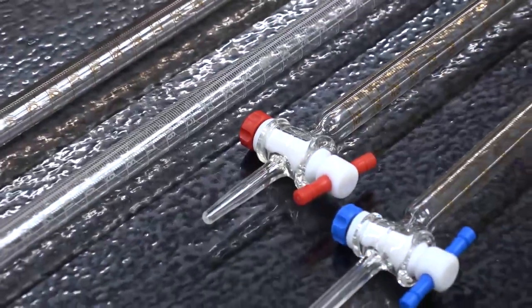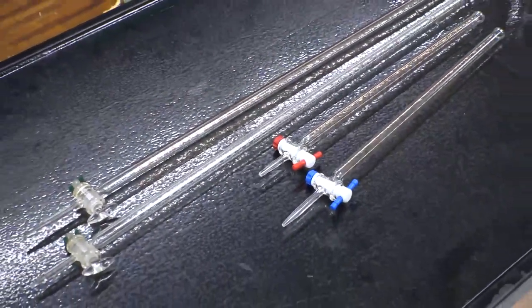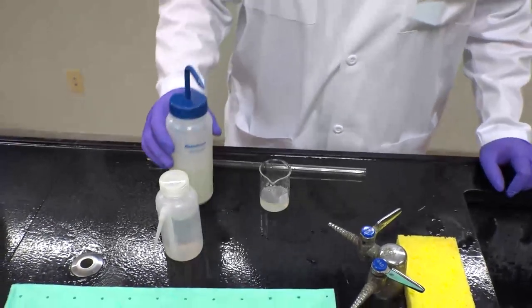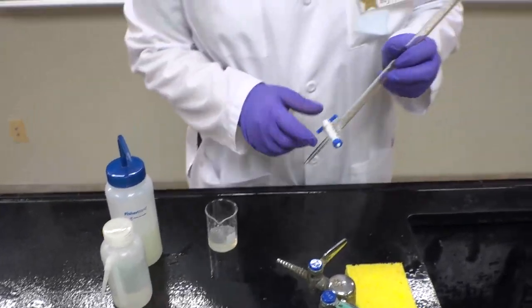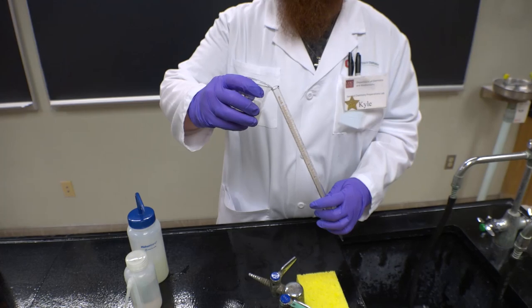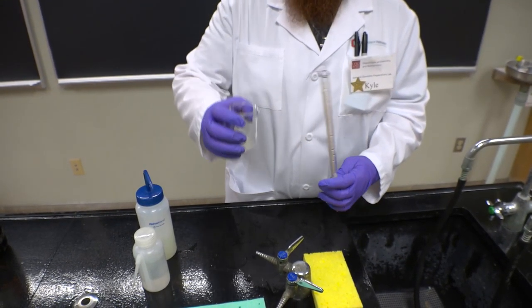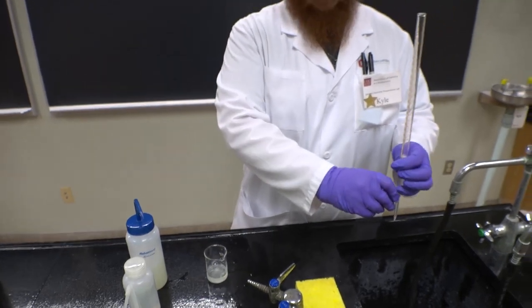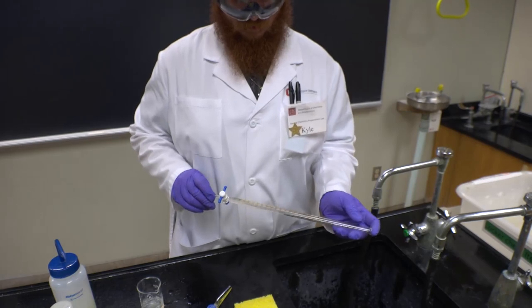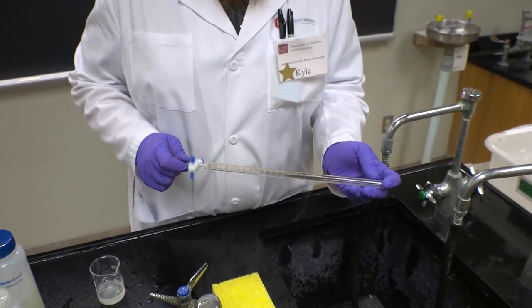If we were to use a brush on the burette, it would likely scratch the inside of the burette, throwing off the accuracy of the calibration. To clean the burette, you first add a little detergent with water into the closed burette. After, cover the top of the burette and rotate it to coat the inside of the burette.